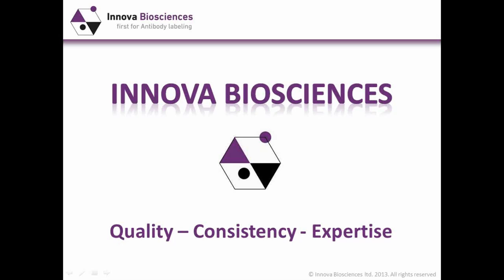Hello and welcome to the 6th episode of the Innova Biosciences webinar series. Today's webinar, A Beginner's Guide to the Principles and Applications of FRET, will discuss the powerful technique of FRET, or Fluorescence Resonance Energy Transfer, and the various ways in which this is utilized in biotechnology.